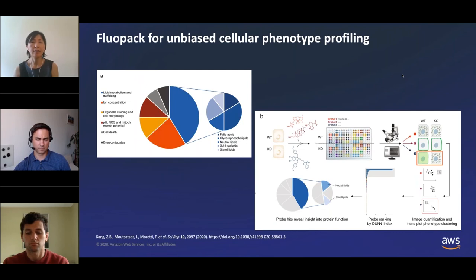You have seen that Nick has presented the application called HCS IA, developed by the teams at Novartis, that allows you to quantify your images at scale. Luckily, this application already has a segmentation-free algorithm incorporated into it.